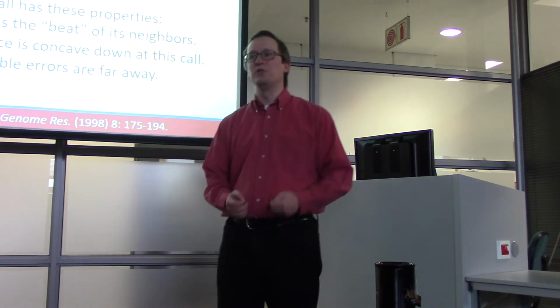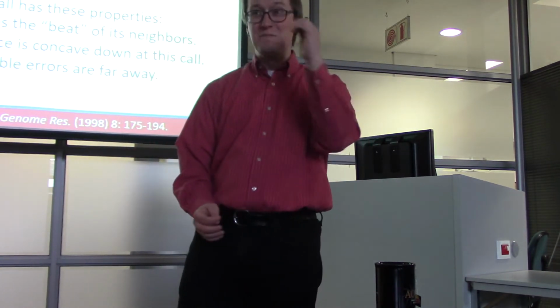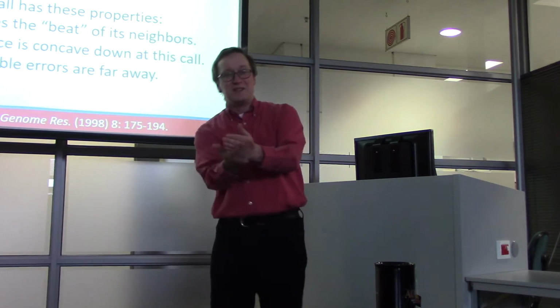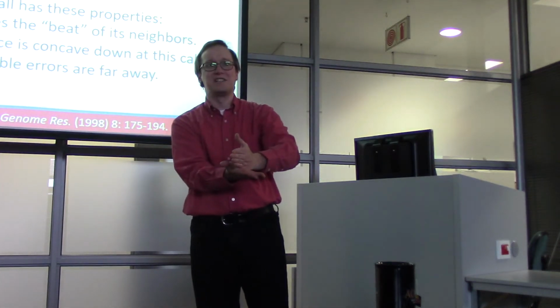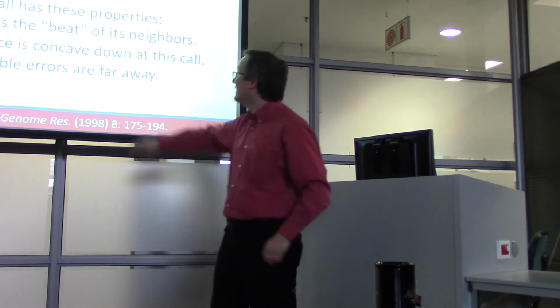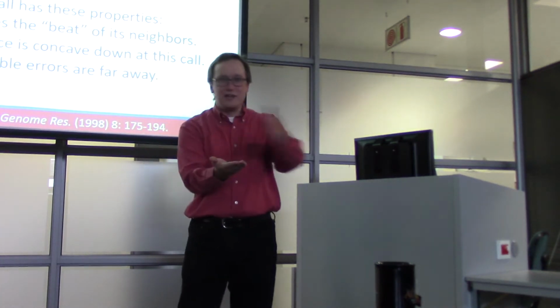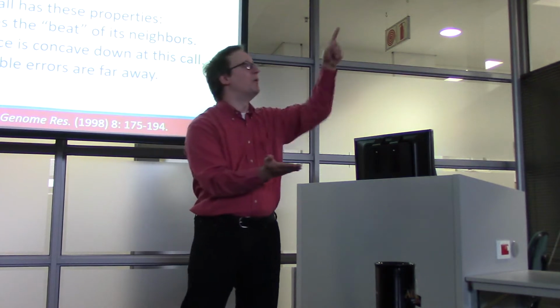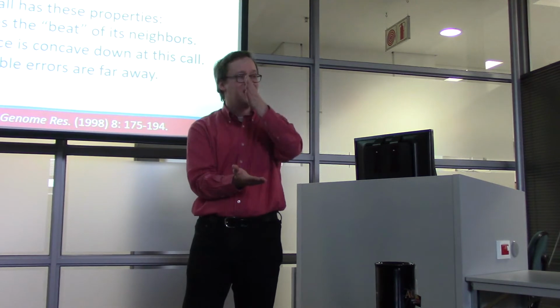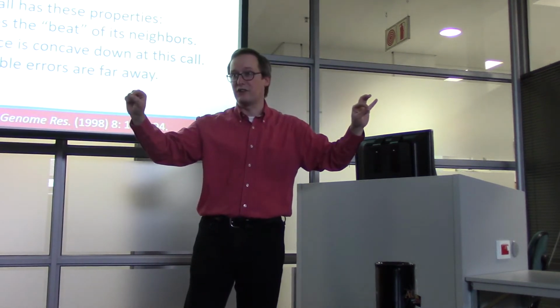You're going to have something like a good whomp, whomp, whomp going in the background. So that is a regular beat. If you were to look at this in a graphic equalizer, you would see this big spike showing up in that part of the frequency spectrum to reflect that you have a repeating signal at that frequency. In the same way, Fourier transform helps us to recognize the beat of an electropherogram. That periodicity of the signal helps us to say, this is how far apart we expect these different base calls to fall in this electropherogram plot.